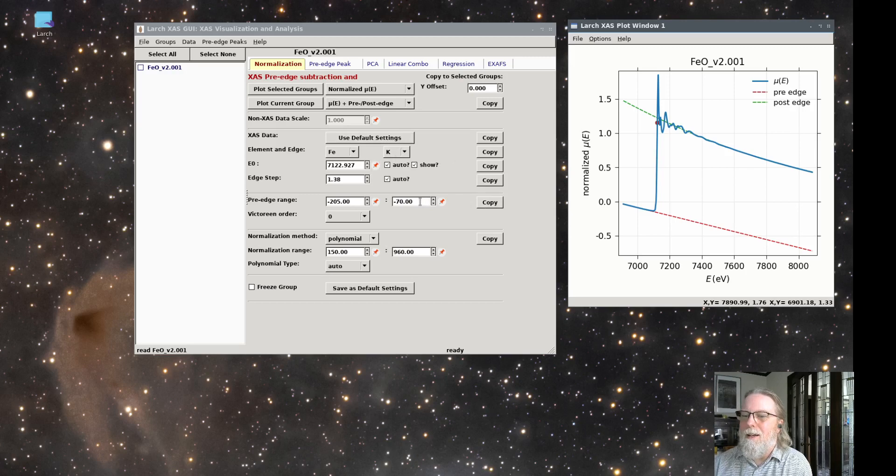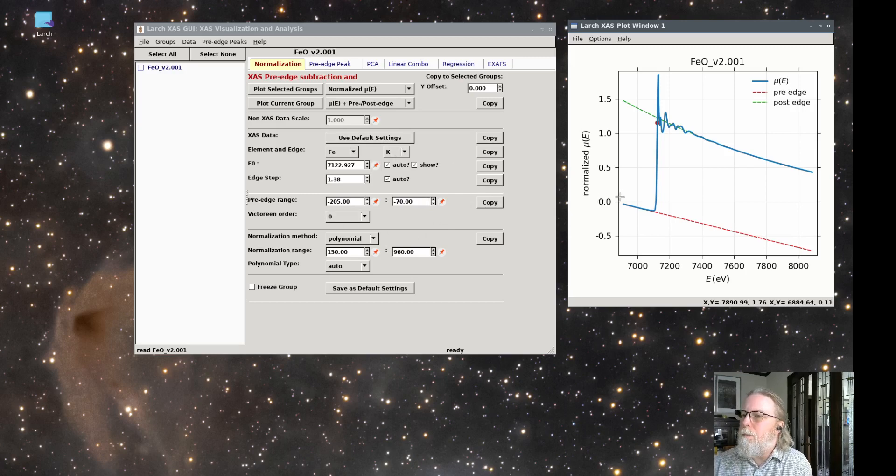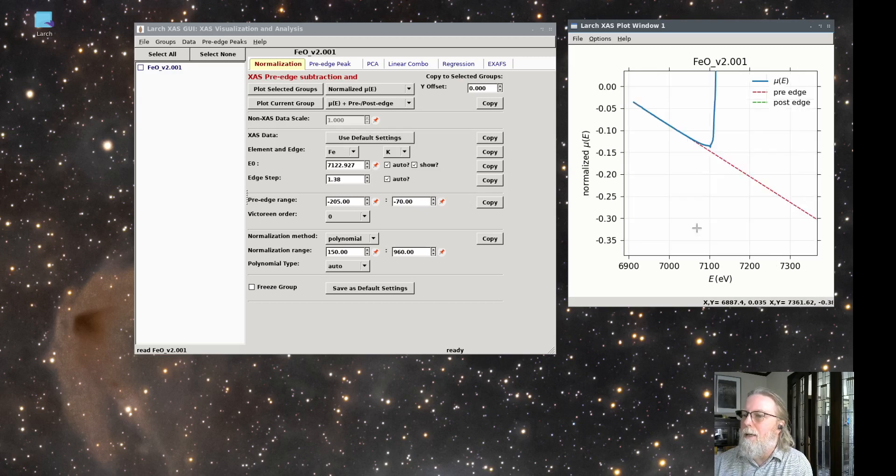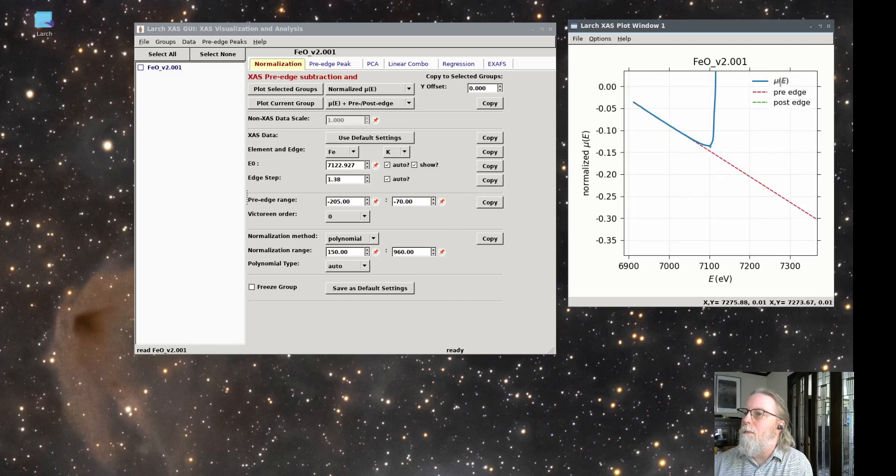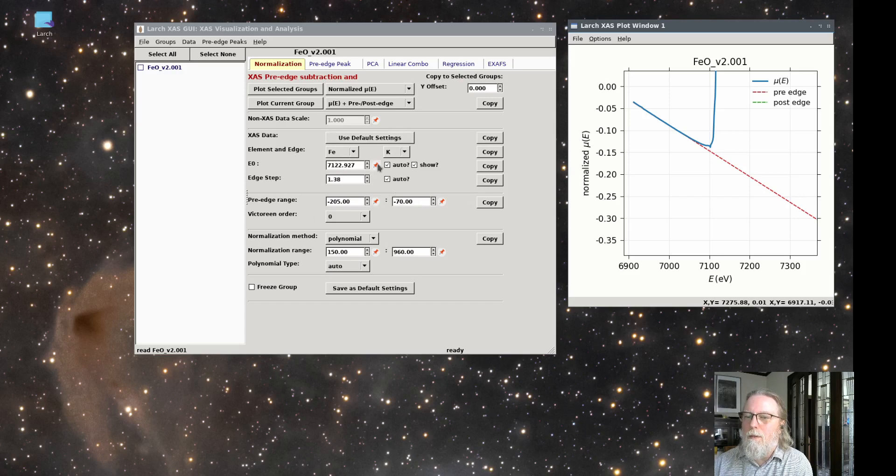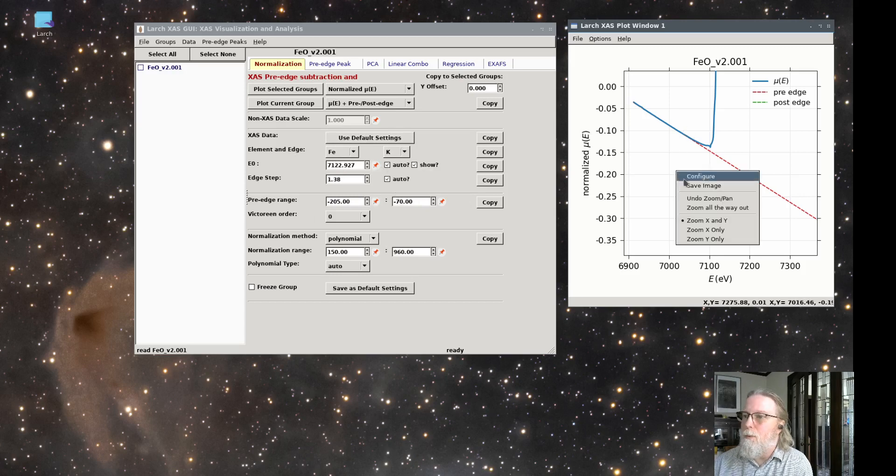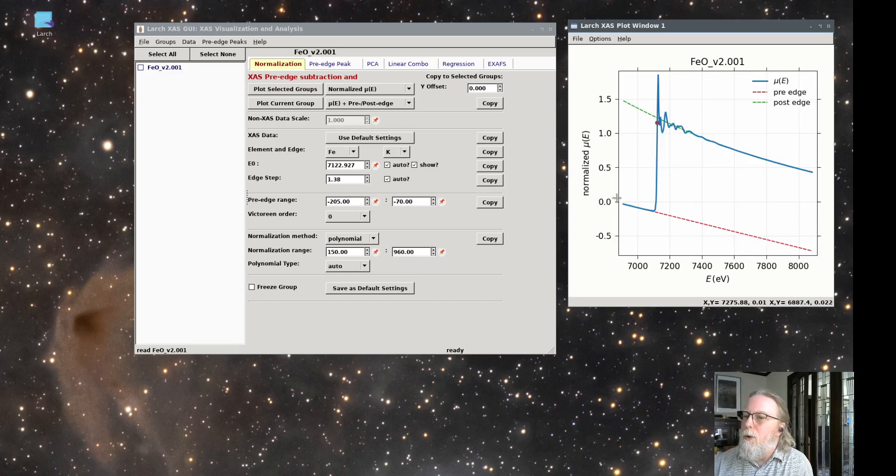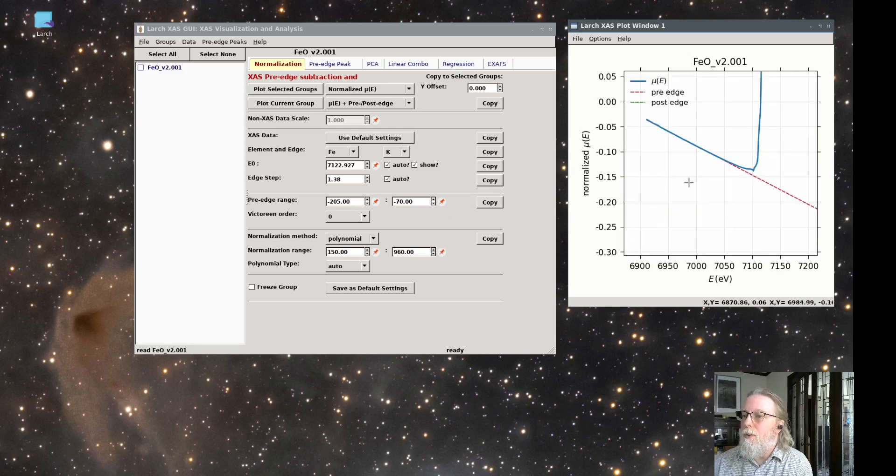So the pre edge range, for the pre edge range, it fits a line by default to the pre edge portion of the spectrum. So from minus 205 to minus 70 EV relative to E0, it's fit a line and it's going to subtract that line from the data set. So you can adjust the range for that.